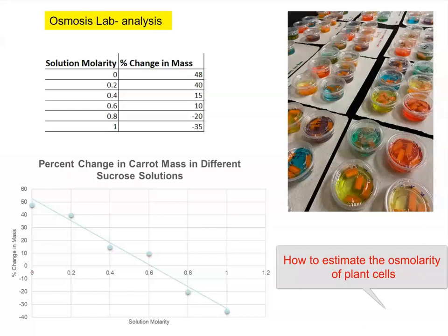So we have prepared different sucrose solutions. You can see they had different molarities: 0, which was pure water, 0.2, 0.4, 0.6, 0.8, and 1.